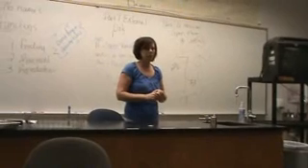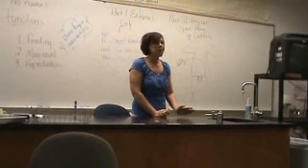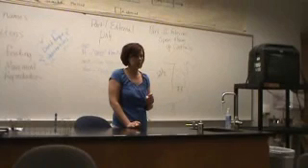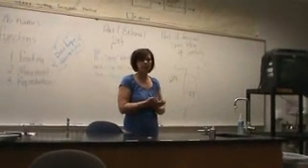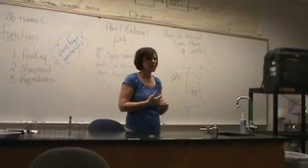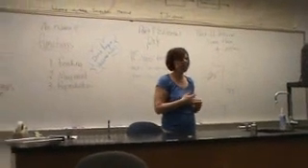So you do want to make sure that you allow enough time for the video and for cleanup, because otherwise it will stink in here for weeks. Okay. Any questions? This one's pretty easy, pretty straightforward, kind of like the isopod one. We're utilizing the scientific process that way.